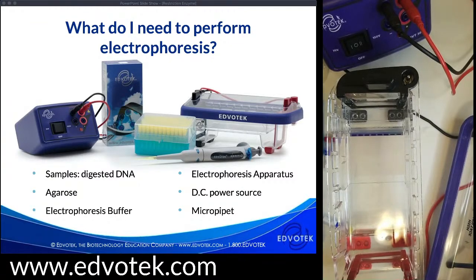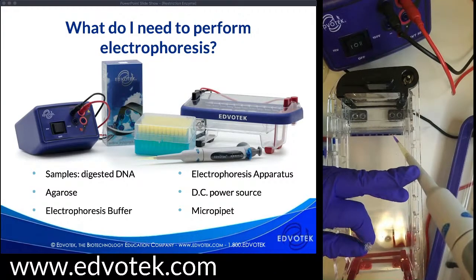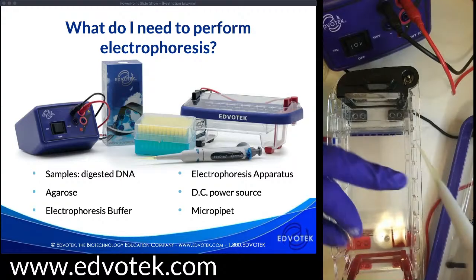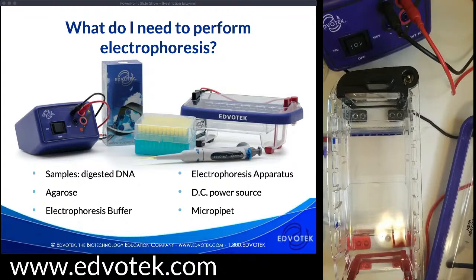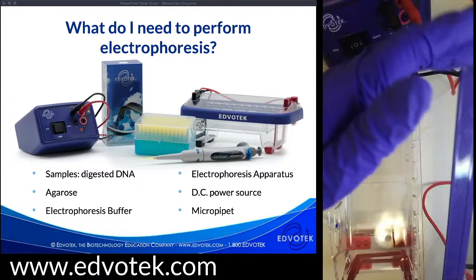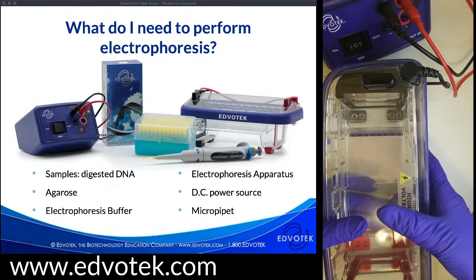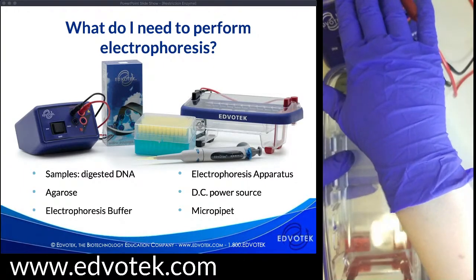Going back to the buffer — we do send it to you as a concentrate. The next important thing for electrophoresis is our buffer, a mixture of buffer and salt. This is important for two reasons: first, water is a really poor conductor of electricity, and the way we're going to push our DNA through our gel is to use an electrical field. Second, we do want to keep the molecules charged, and by having a buffer we can keep the pH at an appropriate level to keep the charge on our samples. Our gel is loaded. Our chamber is wired at each end with terminals connected to leads, and our leads are connected to a power supply which generates the current we need for separation.